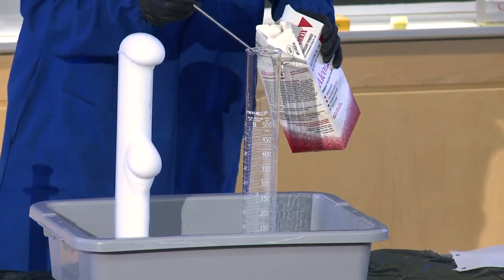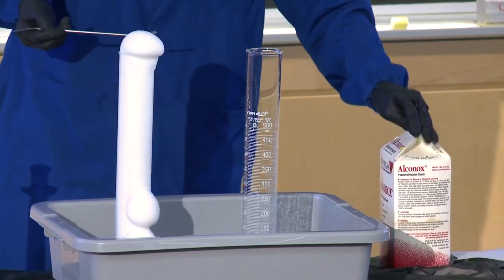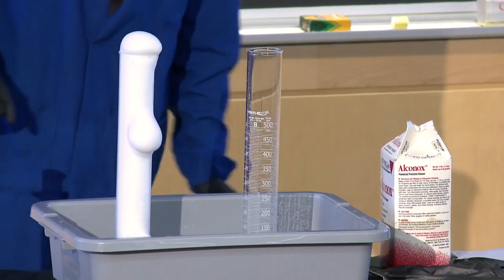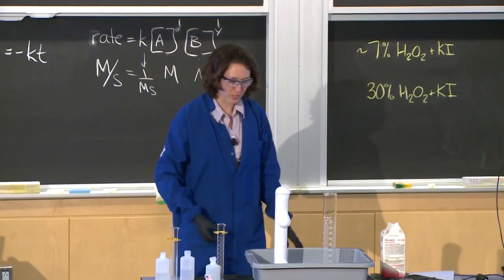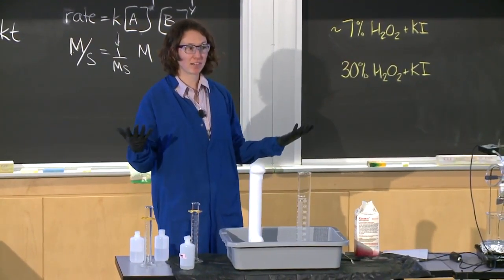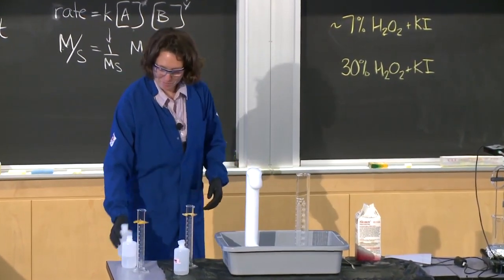Yeah, so it looks like toothpaste, maybe? Toothpaste that an elephant would use? Elephant toothpaste. Yeah, so you may have, in the course of doing some research for this, I also found that some people call it Old Foamy, like a geyser. So you may have heard it by that name.